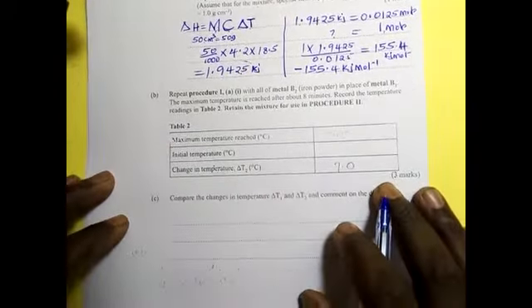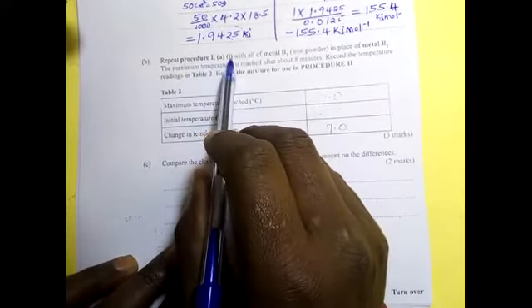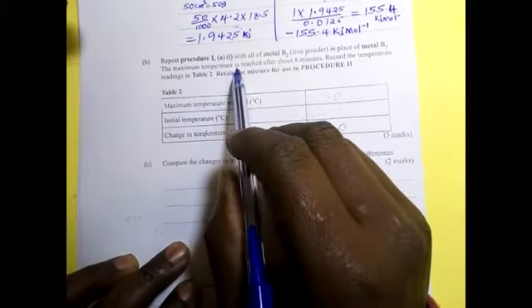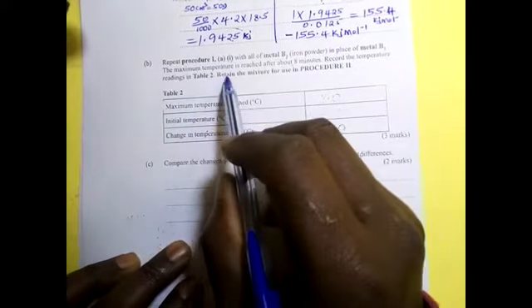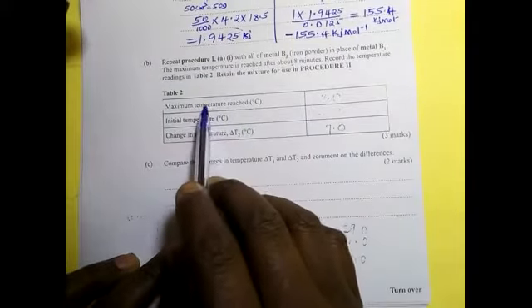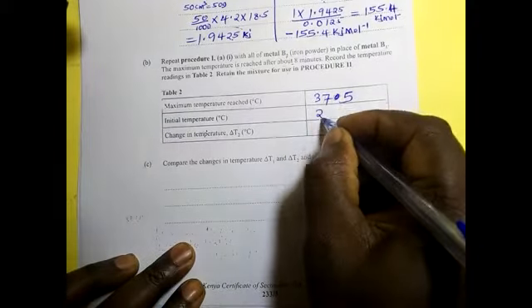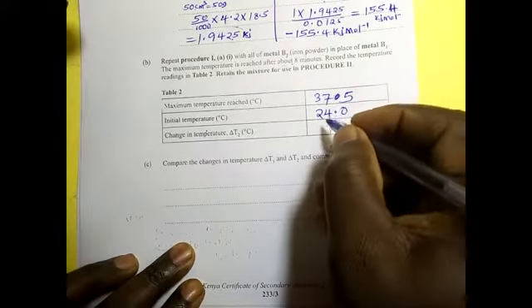Let us go to procedure 2. Repeat procedure 1A, Roman 1, with all the metal B2 iron powder in place of metal B1. The maximum temperature is reached after about 8 minutes. Record the temperature readings in table 2. Retain the mixture for use in procedure 2. So the maximum temperature reached during the experiment was 37.5. Our initial temperature by that time was 24.0. So when you do the subtraction, you will get 13.5.